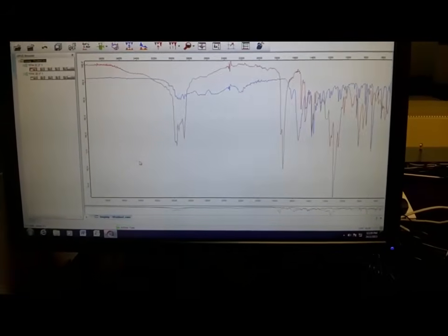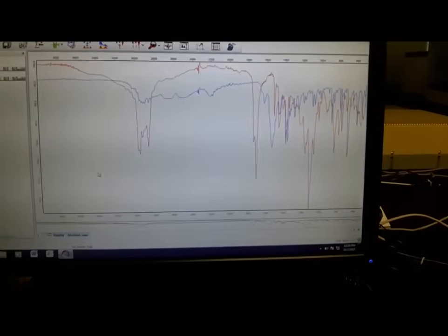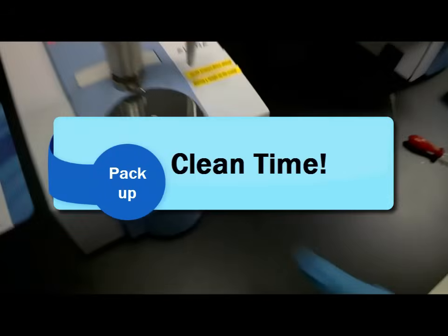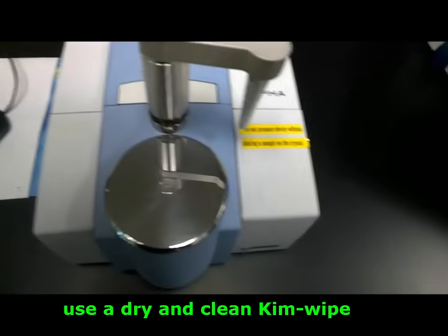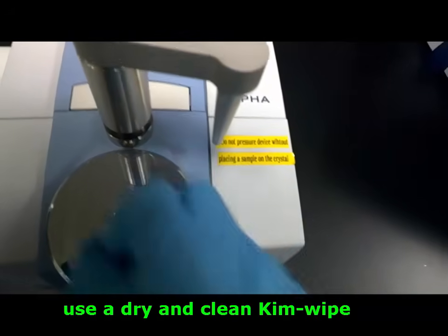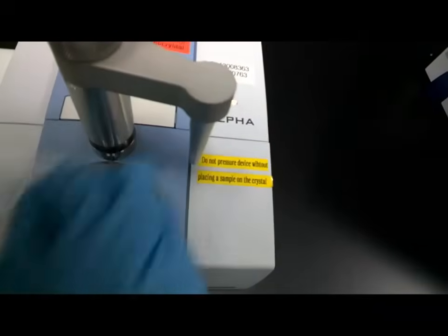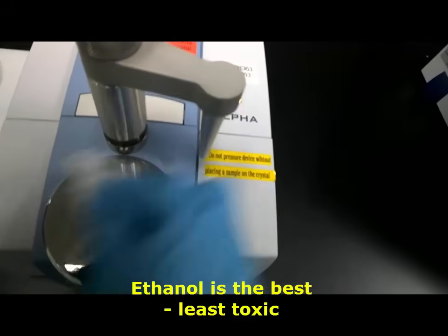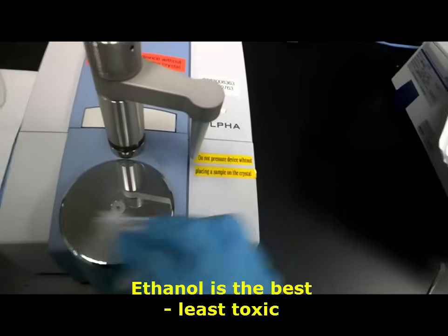The spectrum shown is the result for the liquid sample. Now we need to clean it up. First, use a clean Kim wipe and wipe off the liquid. After that, put some alcohol on the Kim wipe and wipe it again — using some solvent to erase it off. Try to use ethanol, as it is the least toxic among all the alcohols.